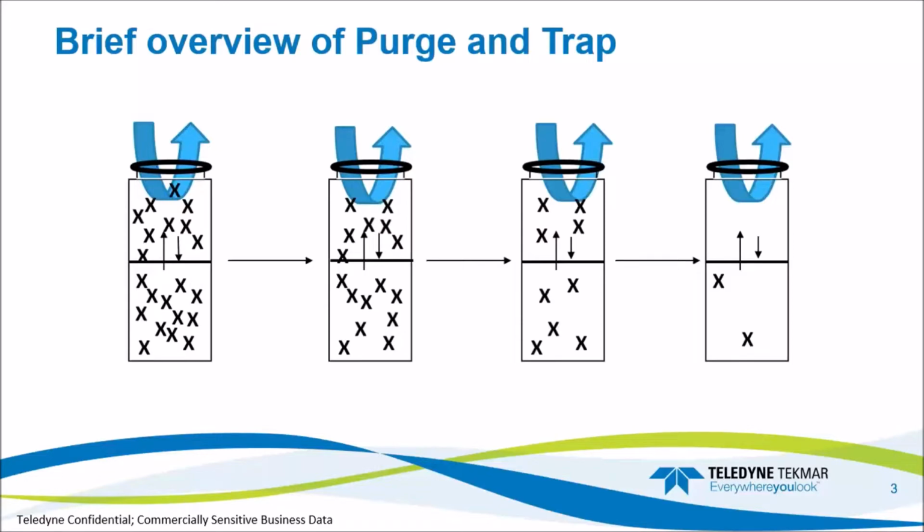The theory of purging and sweeping a sample with an inert gas is called the dynamic headspace theory. It sounds simple, but it's a very complex process. Purging a sample to extract analytes is a gas extraction. In purging a sample, the system is no longer at an equilibrium. And this is because the VOCs that move into the gaseous phase are constantly being removed by the purge gas.